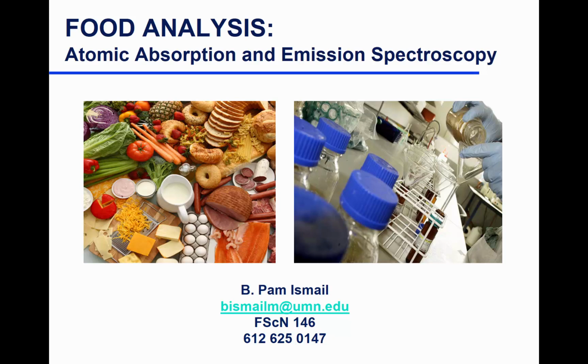So just as a refresher before going into atomic absorption, what's the difference between absorption and emission spectroscopy? Let's get that out of our system before moving on, because there is atomic absorption and there's atomic emission. So let's be on the same page. Ted.